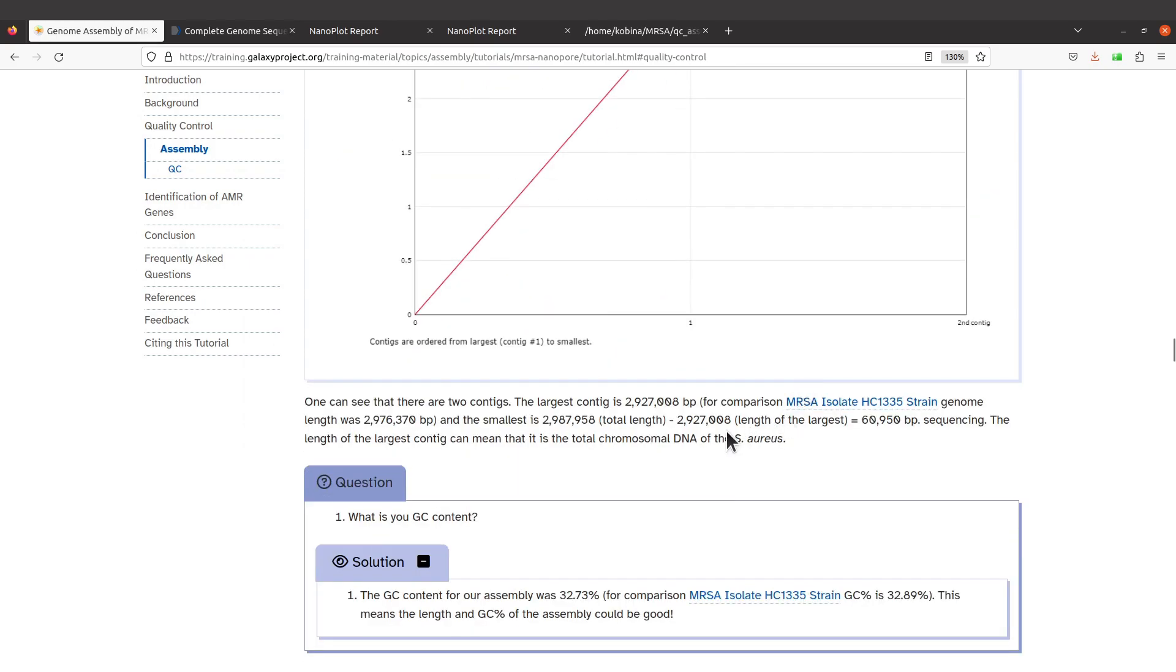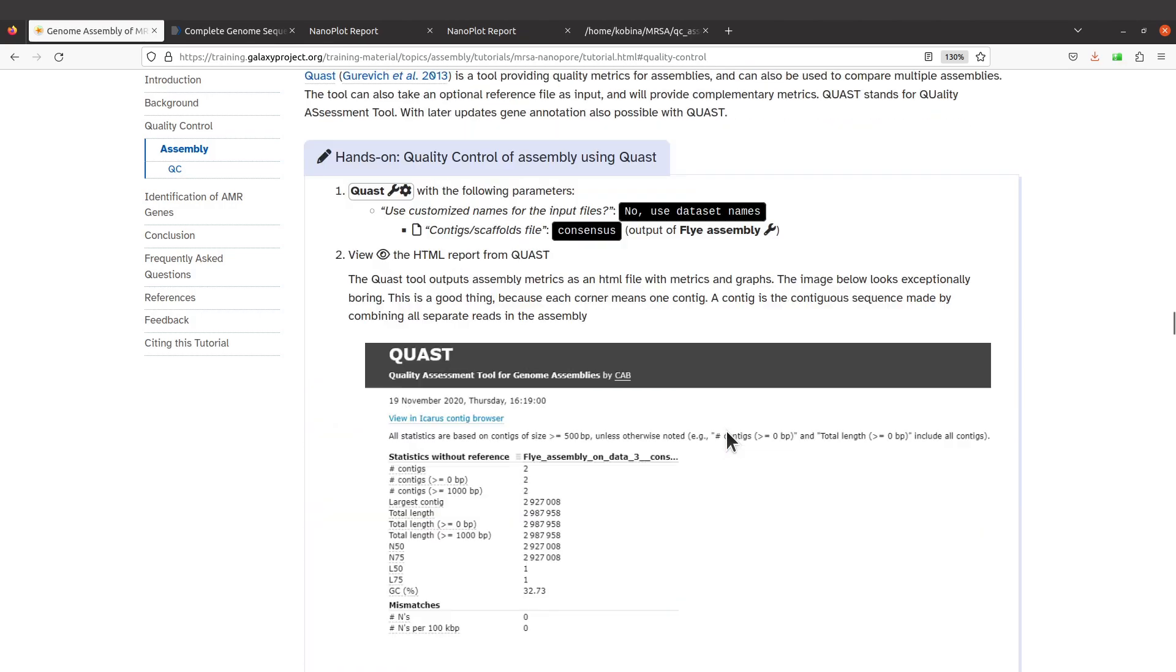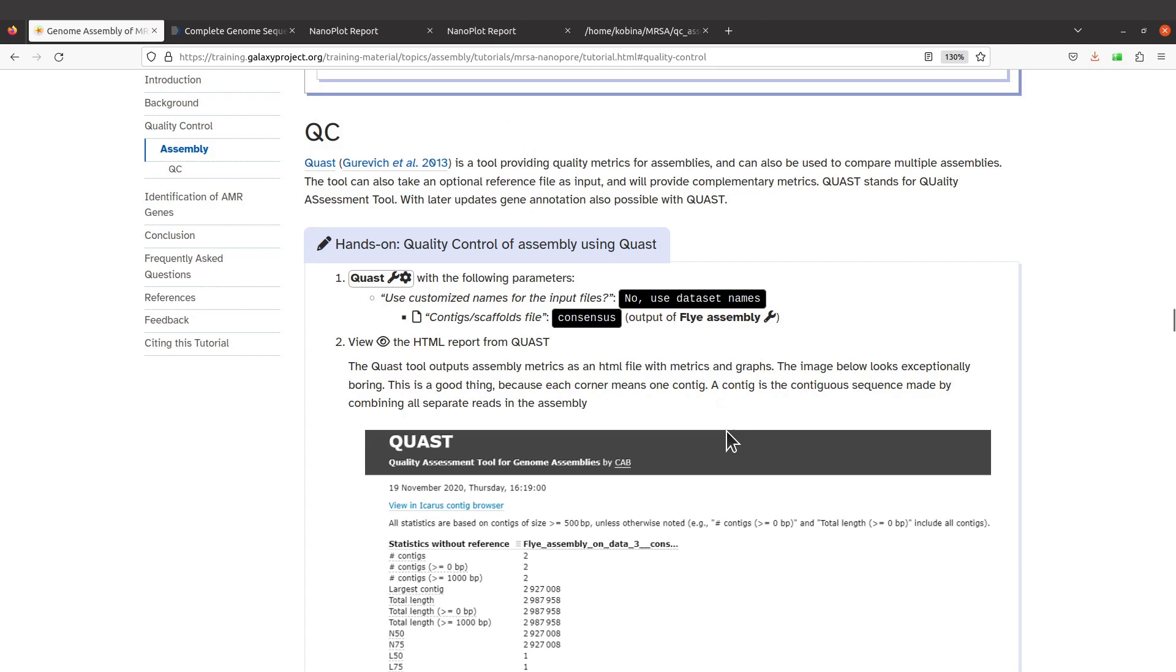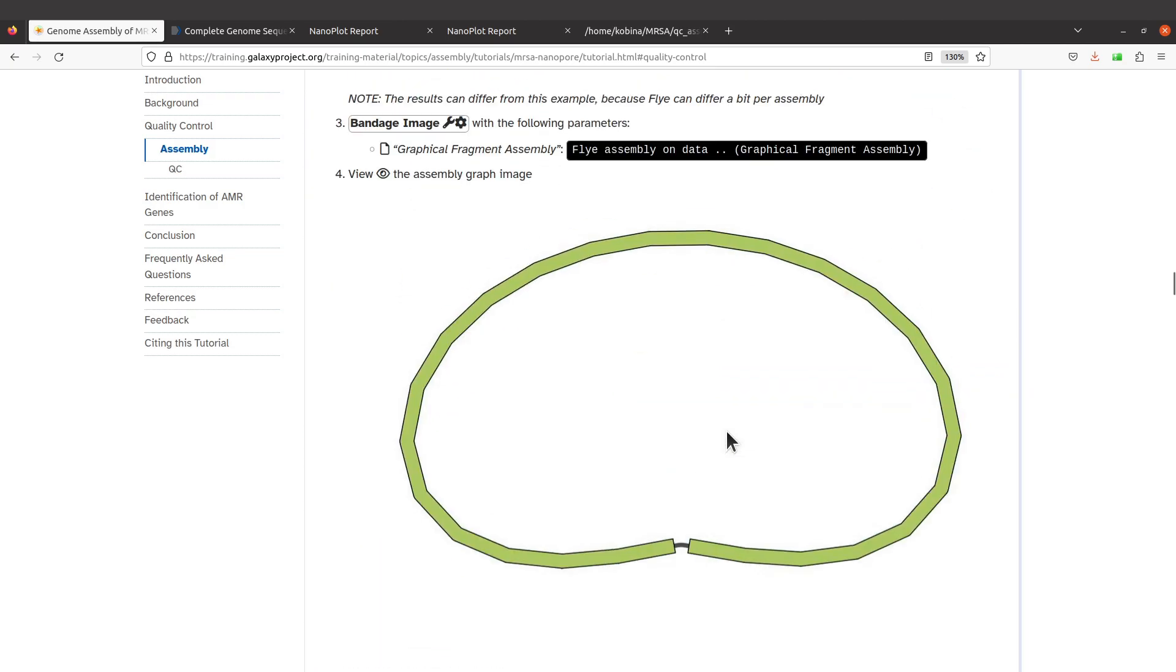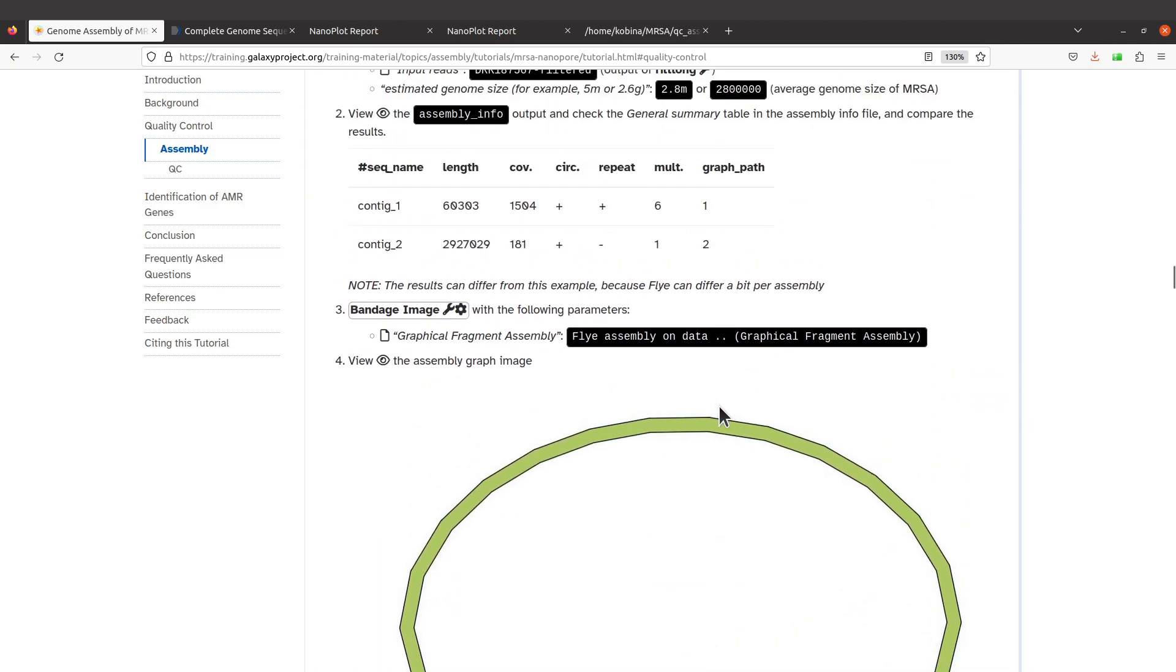So there could be a number of reasons. One possible reason would be the Flye assembly. Remember we had this note here warning us that the results can differ from this example here, because Flye can differ a bit per assembly.